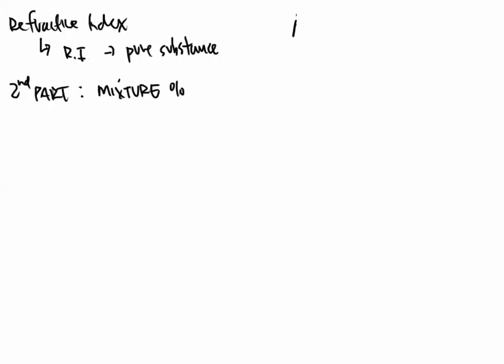Let's say I'm given an A component and a B component. These are 2 different compounds. What those compounds are, we'll tell you the day of, because whatever we feel like making, that's what we'll do. In order to analyze a mixture, I need an equation.